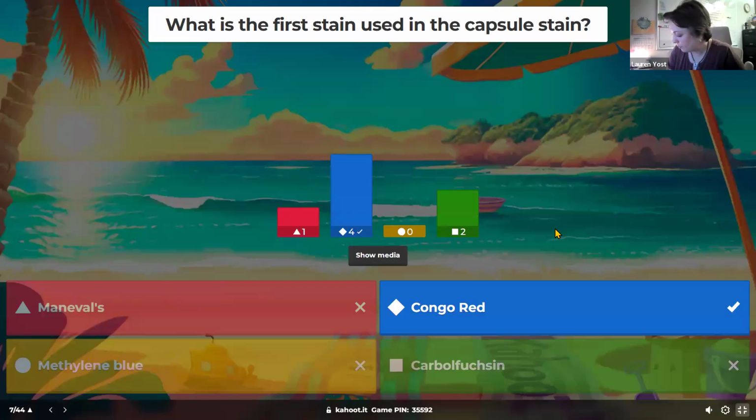Capsule. Positive had a halo around the cells, right? A clear, colorless halo around the cells. That was what the actual capsule was depicted as. Now, if you have a halo around the cells, how do you get a halo? You have a background. That's important to remember. That is the most important thing to remember about the capsule stain.